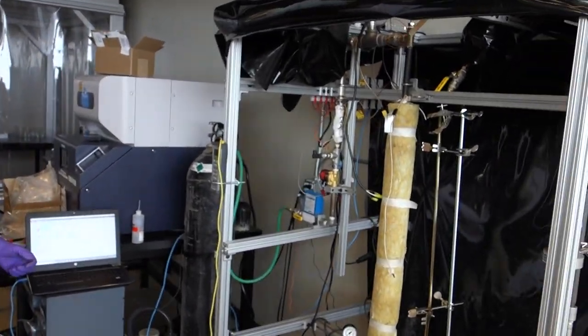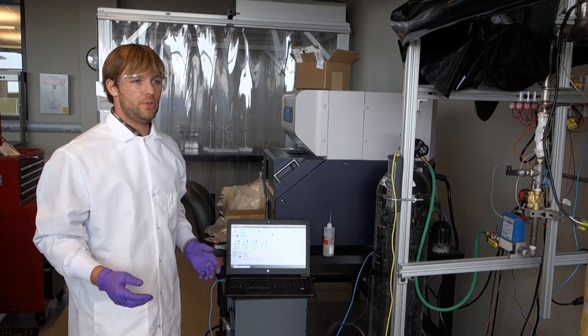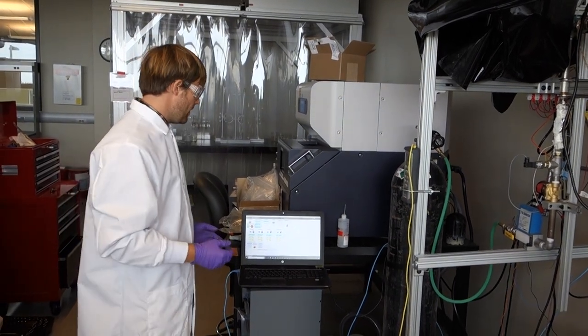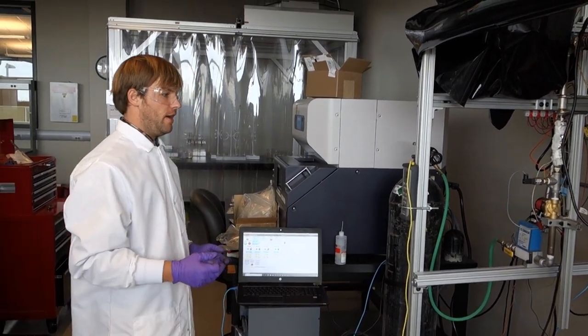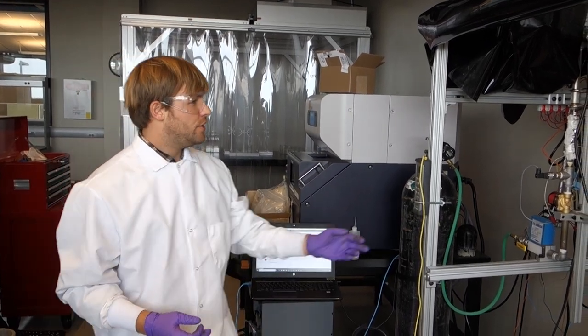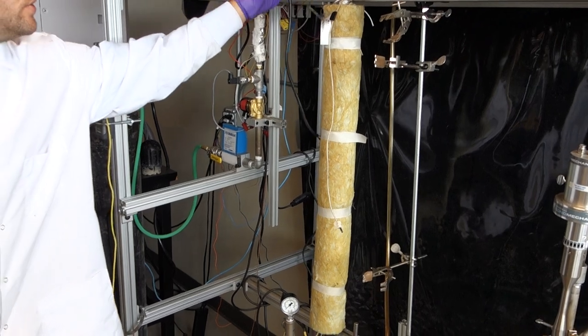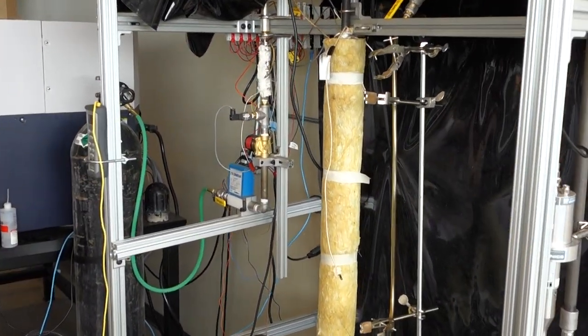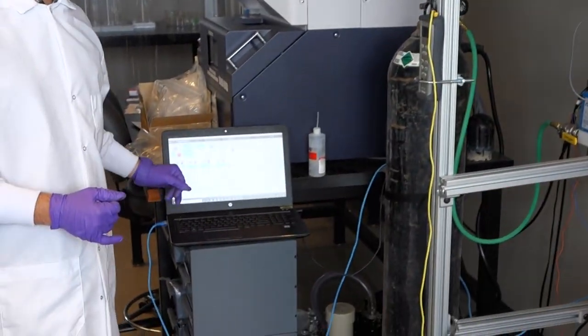If you look back this way, one of the biggest contributions that our process is making is optimization via cyber-physical control of the entire system. Each of these temperature heaters is controlled by this laptop here.